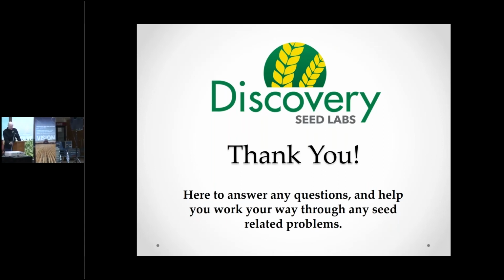The answer is this test can be done at any time of the year. As long as you can get to the soil, we can run the test. It does take about a week to do, so that would be the only thing, to give yourself enough time. Typically, most people will survey their prospective fields that they want to put pulses on. They'll do that in the fall. After harvest of the previous crop, they'll go in and do their soil samples, and we can detect it, and then they'll know the next spring whether they can go right in there.